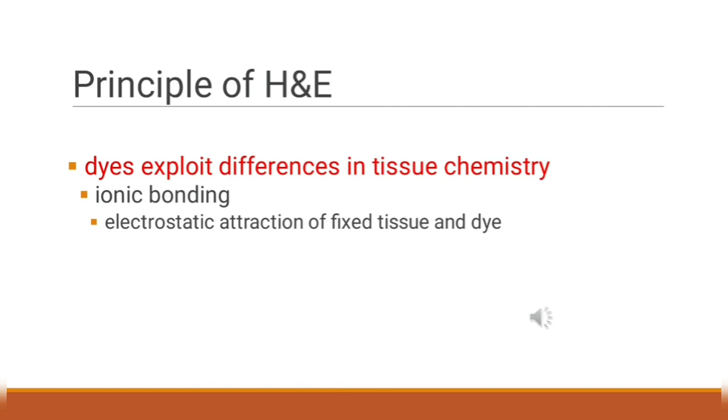The principle behind H&E staining is the chemical attraction between the tissue and the dye. Hematoxylin, which is a basic dye, imparts blue to purple contrast on basophilic structures, primarily those containing nucleic acid moieties such as the chromatin, ribosomes, and cytoplasmic regions rich in RNA. An acidic eosin counterstains the basic elements such as RBCs, cytoplasm, muscle, and collagen in varying intensities of pink, orange, and red.